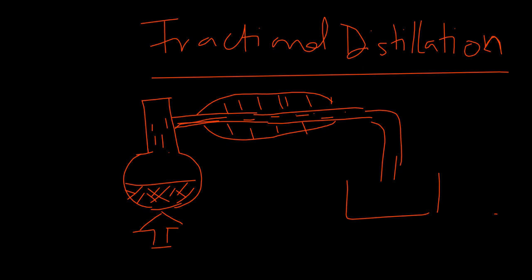At this point, water has started boiling. Because water has started boiling, remember anything that boils will vaporize. That water would also start vaporizing, and we will follow the same process. Once it vaporizes, it will be captured in the condenser. Remember, once you get there, there's a cold environment, so that water vapor would also be captured, and it would end up in the container here. You capture the water too.